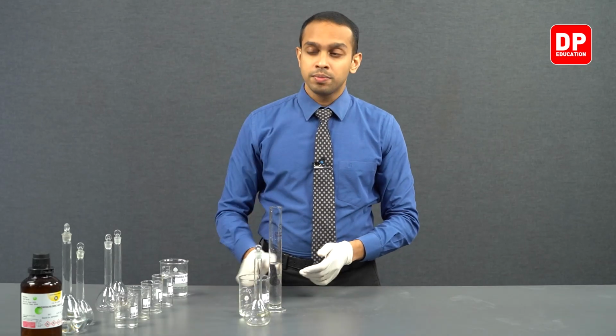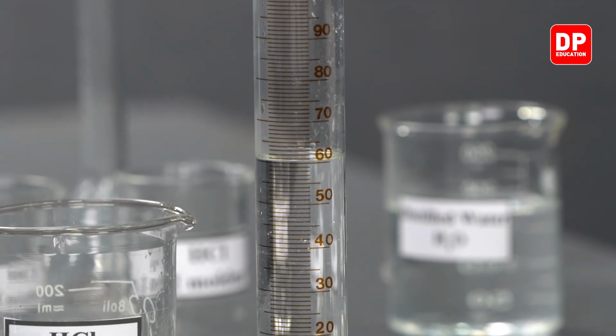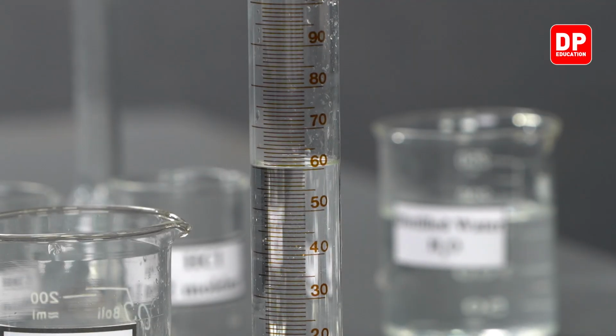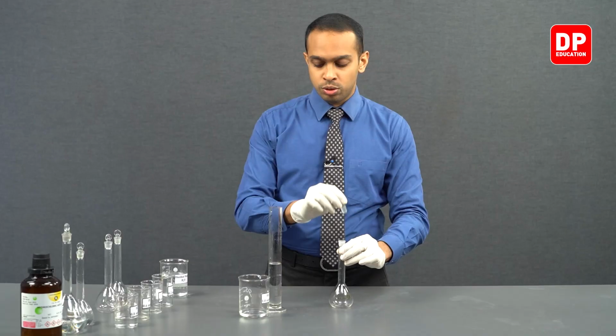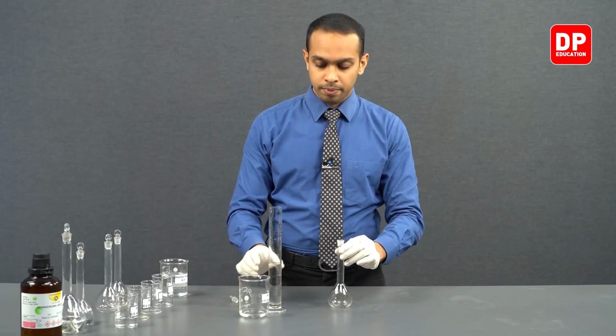We have measured exactly 60 milliliters of 1 mole per decimeter cubed concentrated HCl. Now we can proceed to transfer it into a volumetric flask.